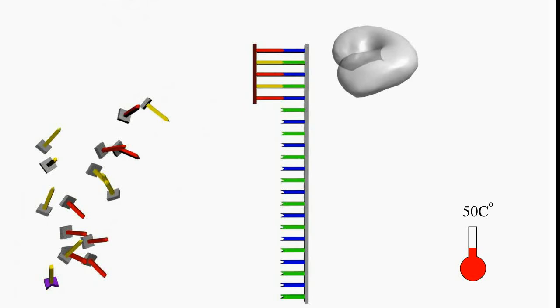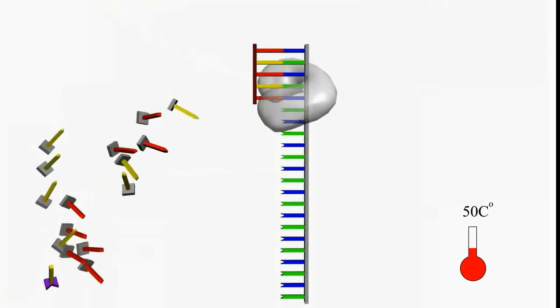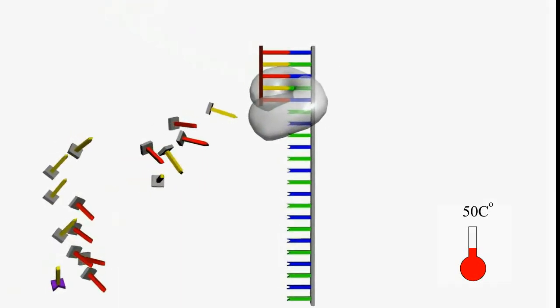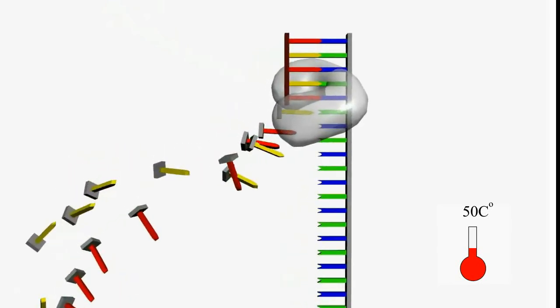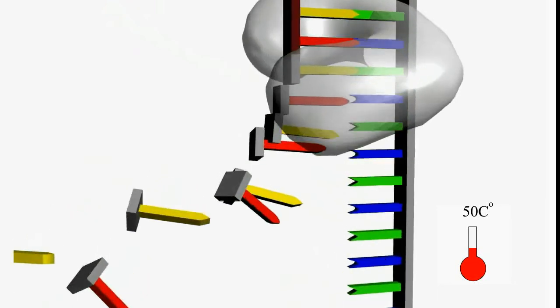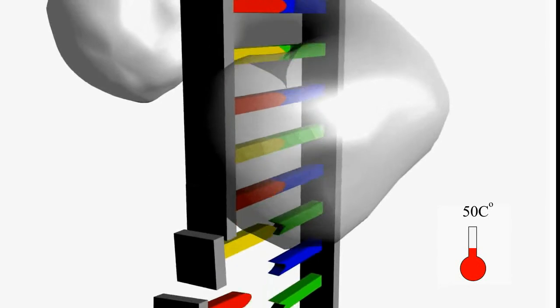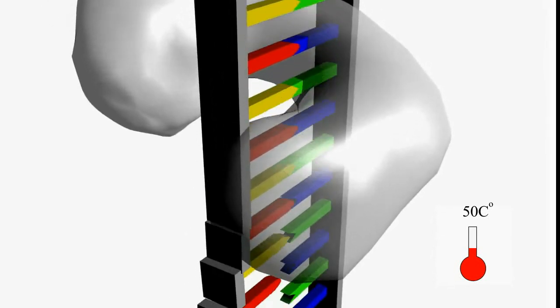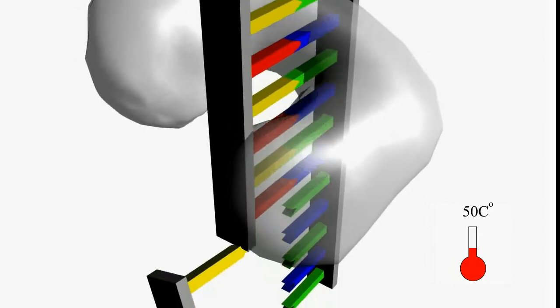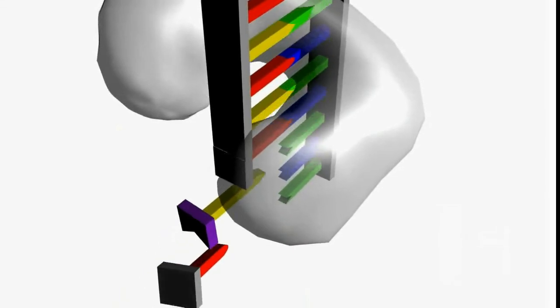The extension step starts, where the temperature is raised gradually to approximately 60 degrees Celsius. This is the ideal working temperature for the polymerase. The polymerase catalyzes the replication process, and this replication continues until the ddNTP molecule combines and halts the replication for the same reason we discussed earlier.